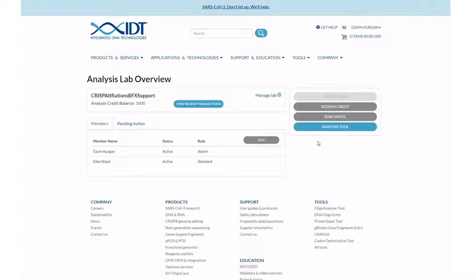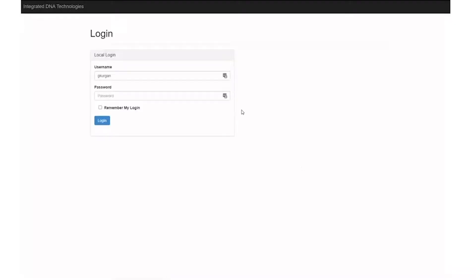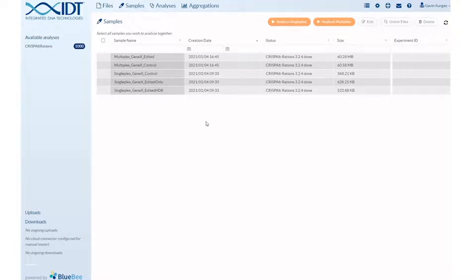Now let's enter the RAMP-C CRISPR analysis tool. Click the blue analysis tool button. This brings you to a new login page. Enter your IDT account credentials again for security purposes. Now you are ready to start analyzing data.